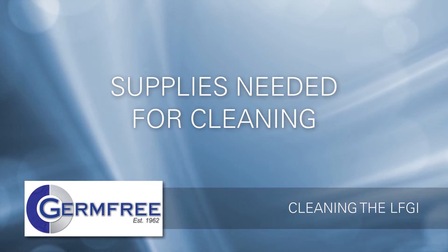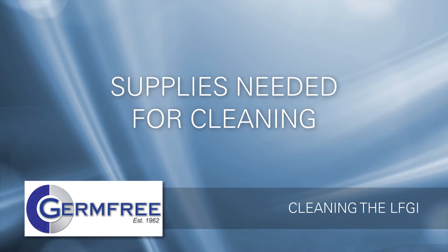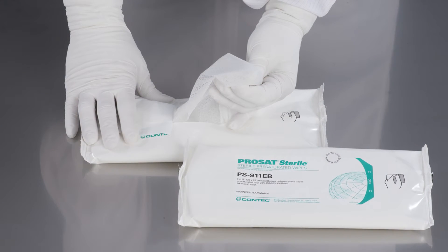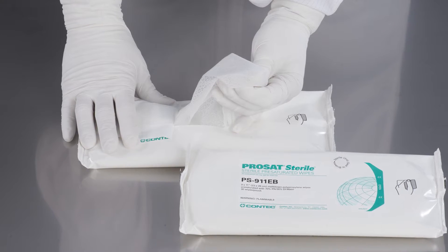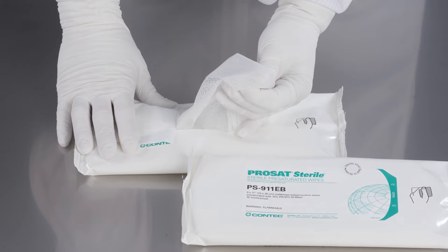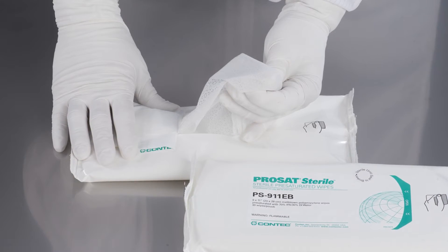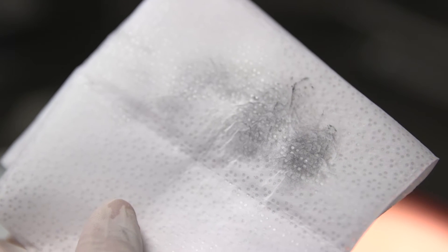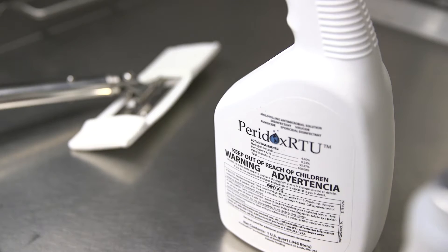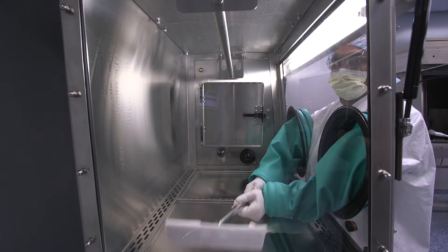Depending on what you're processing, you may need some or all of the following items to clean your LFGI. Pre-saturated sterile 70% isopropyl alcohol wipes and pre-saturated disinfectant wipes can speed the cleaning process by getting the right amount of disinfectant or sterile alcohol solution onto the surface and by trapping and mechanically removing contamination. Some surfaces are harder to reach and may be cleaned more effectively by a liquid disinfectant or sterile bottled alcohol applied to a cleaning pad on an isolator cleaning tool.